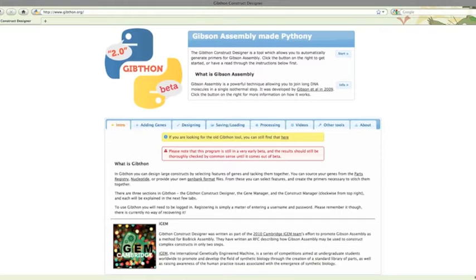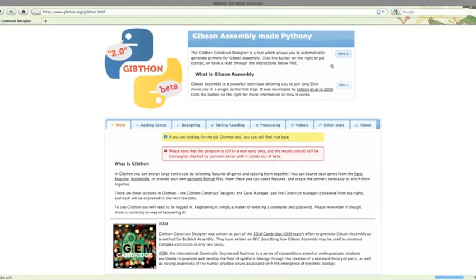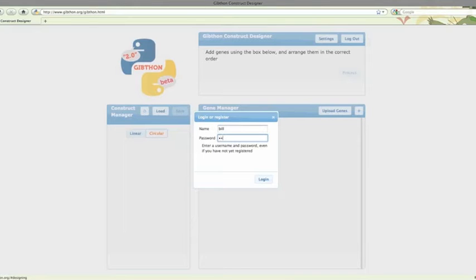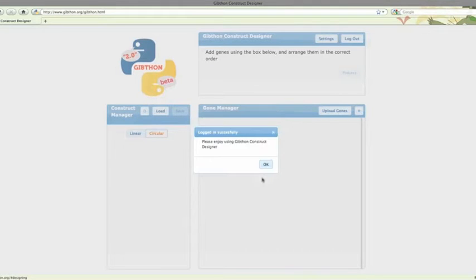In this video, I'll be working through how to build a construct in Gibthon Construct Designer. What we'll be building is an arsenic sensor that uses the 2010 Cambridge team's Vibrio fischeri Lux Operon as its output, and the 2009 Groningen team's arsenic promoter, all sitting in our old friend PSB1C3.